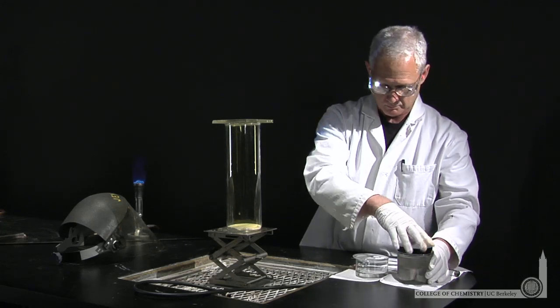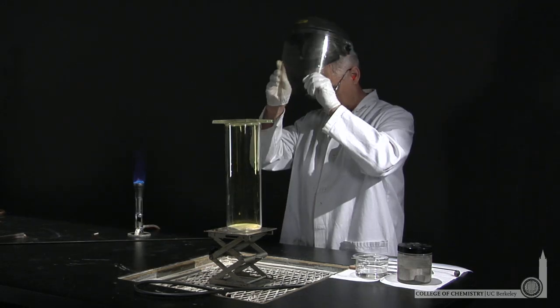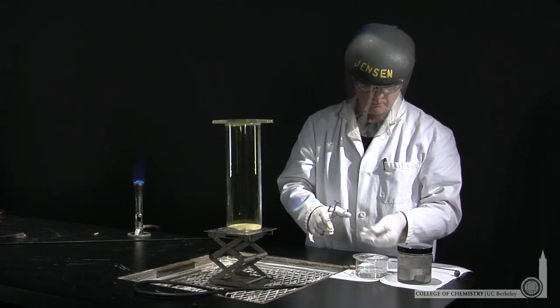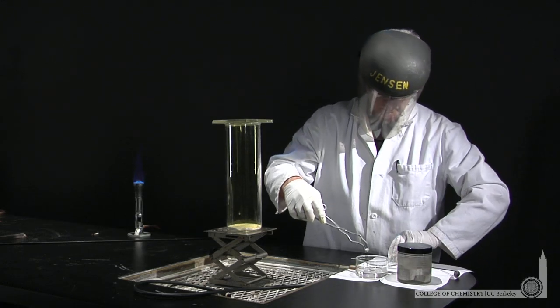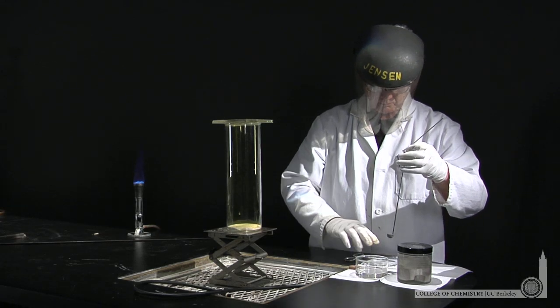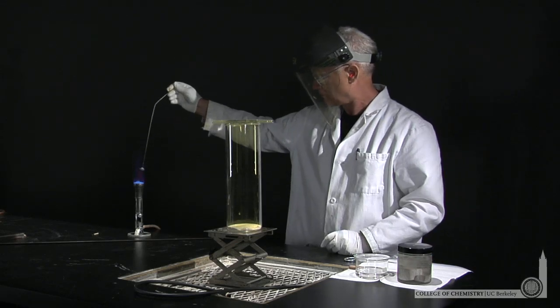To get the reaction to go, he'll want to clean the sodium — make the surface very clean — and warm it slightly to help the reaction proceed. He'll do that by placing the sodium in a spatula and then warming it over a flame to clean the surface and to get the sodium warm enough to initiate the chemical reaction.